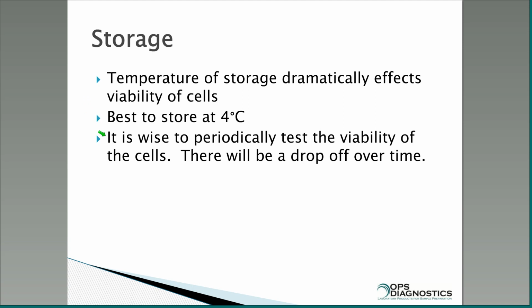And I would start off by testing a sample, let's say once a month, and then after I see it's not changing, once a year, and then every few years. And it will just let you know where your samples are and whether you need to grow them up again and start your process all over.